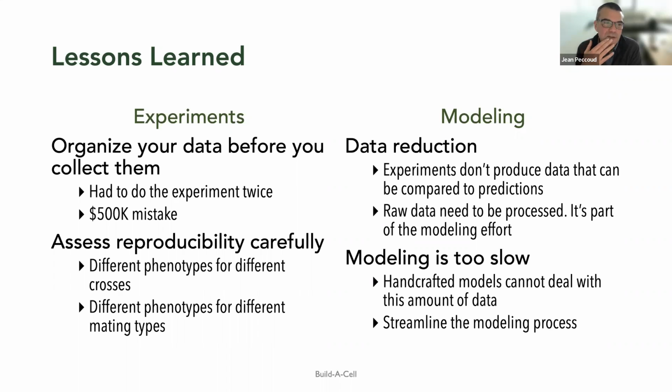And eventually, I decided to just prevent people from getting into the lab until we analyzed the data that they had already collected. And what we saw is that actually it was such a mess. There were thousands of Excel spreadsheets everywhere, but it was very difficult to actually figure out where those spreadsheets came from and things like this. And the entire thing was essentially unanalyzable.